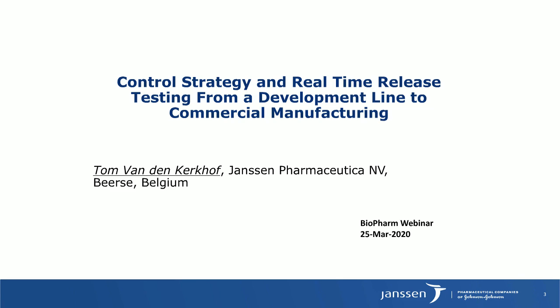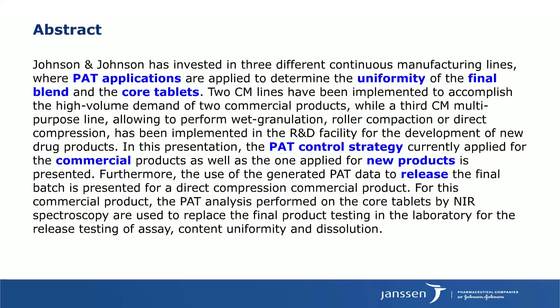Okay, thank you, Marcus, for this introduction. So during this webinar, we will talk about the PAT applications that we use to determine the uniformity of the final blend and of core tablets. Next to the description of the PAT applications, we will talk about the control strategy that we use for the commercial manufacturing area, as well as for commercial products and for new products that we introduced. And as a last point, we will talk a little bit about the release of the products that we have produced via continuous manufacturing.